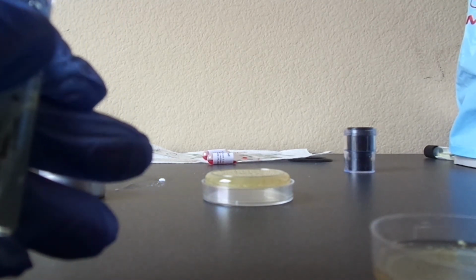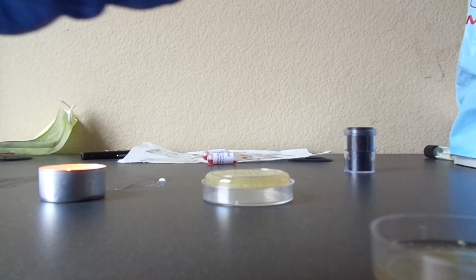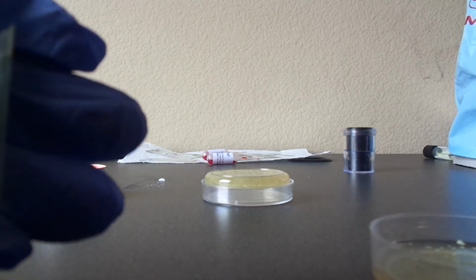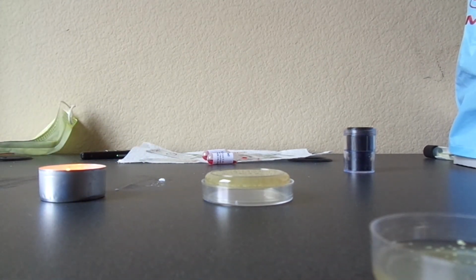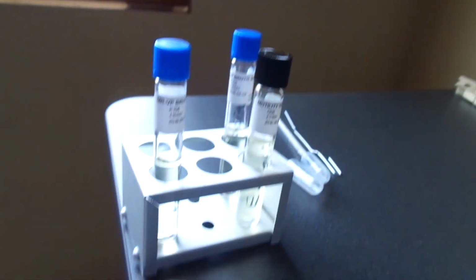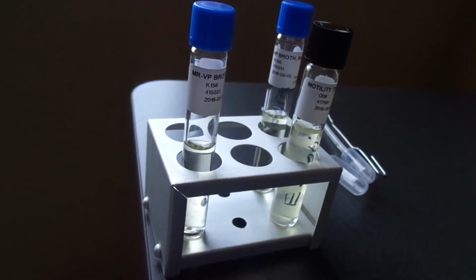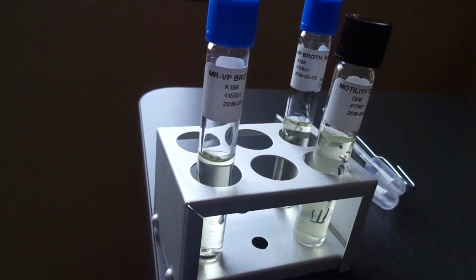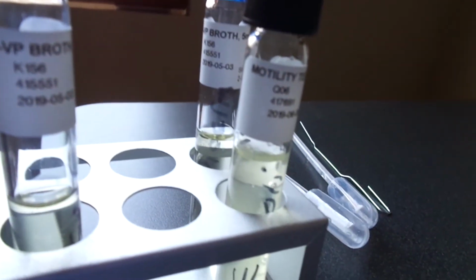All right. And I'm going to close this. And we're going to incubate both of those for 3 to 4 days, and then we'll come back and add the chemicals to the MRVP broth to see if it changes the colors, changes red, and then we'll see the growth pattern of the motility agar.